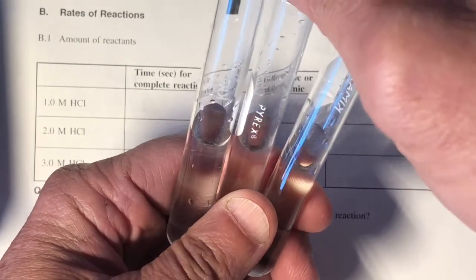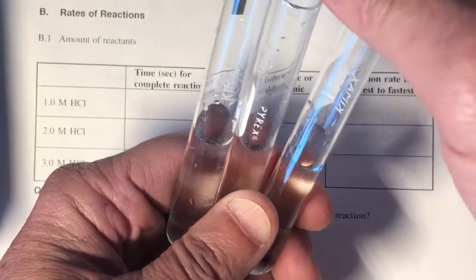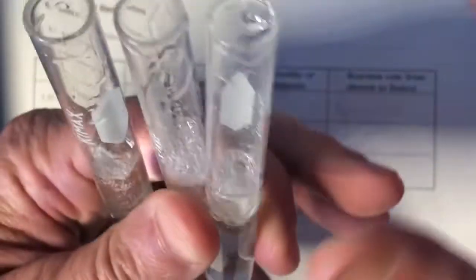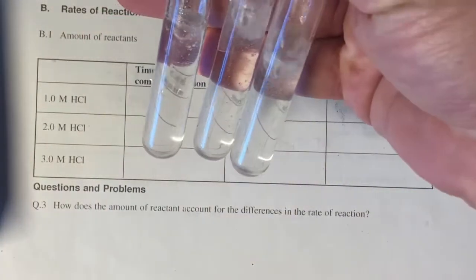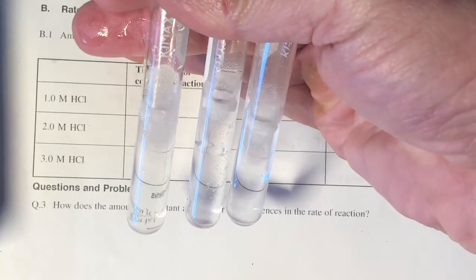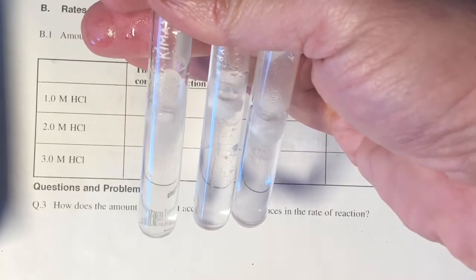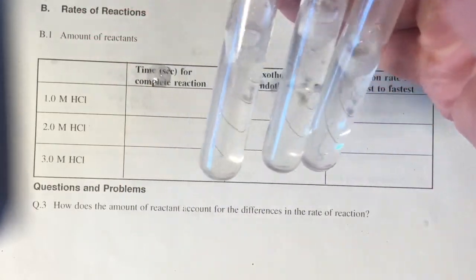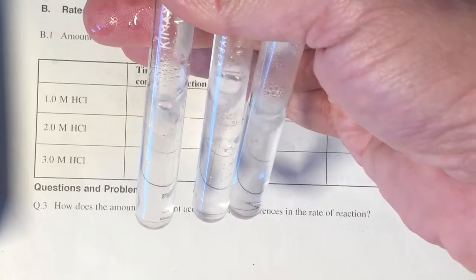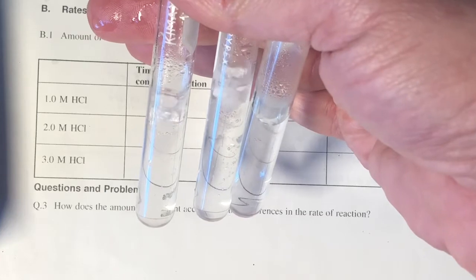So there's 1, there's 2, there's 3, and I hope I don't make too much of a mess when I do this. It's a very vigorous reaction. Oops. This is the same reaction of the magnesium hydrochloric acid lab where we did the gas laws, collected the hydrogen.